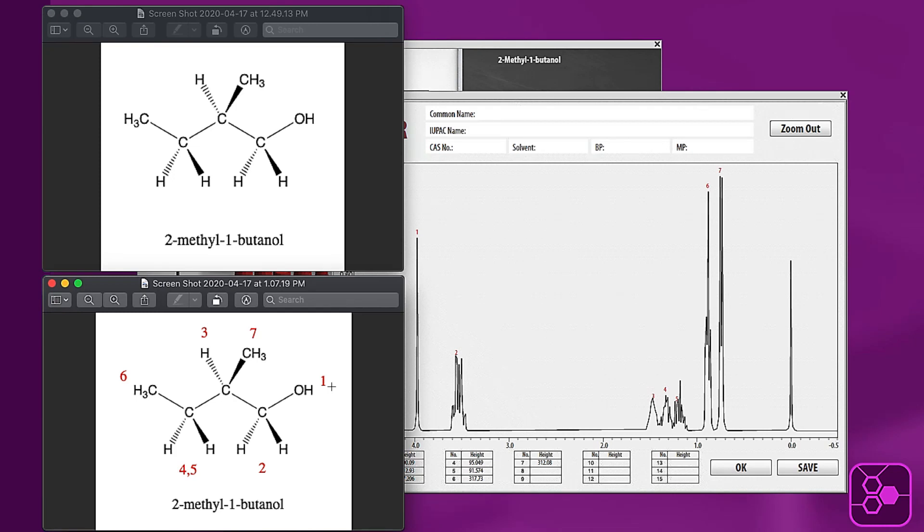And this you could go ahead and use to fill out the worksheet, putting in the chemical shifts, the splitting of each one of the peaks. And then also if you were asked by your professor or teacher to make an assignment of specifically which protons correspond to which peaks. So hopefully that helps.